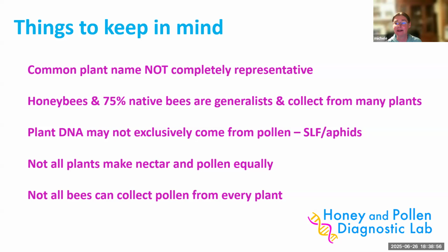Turns out that you can pick up plant DNA from spotted lanternfly honey, because there's enough of the honeydew that the spotted lanternfly feeds on left after it passes through the digestive system that my metabarcoding will occasionally pick it up. We were getting some really oddball plants, plants that we knew darn well weren't blooming at that time, showing up in a particular sample. So that's another oddball.